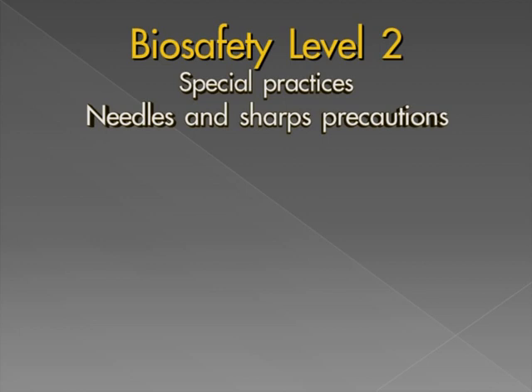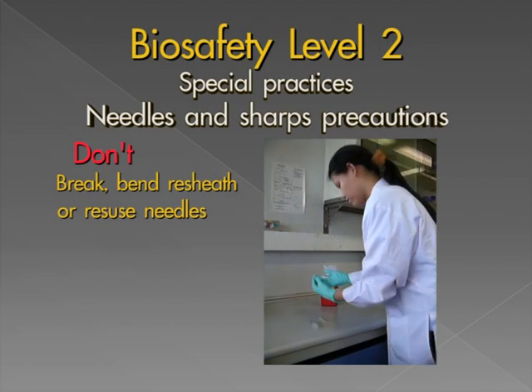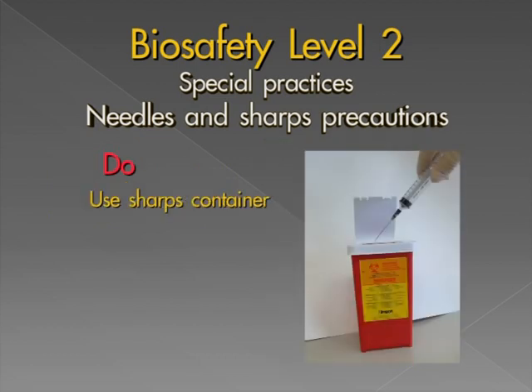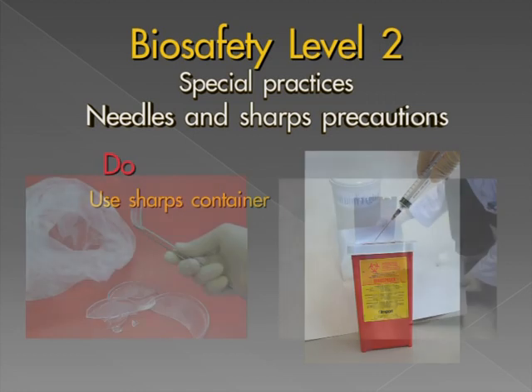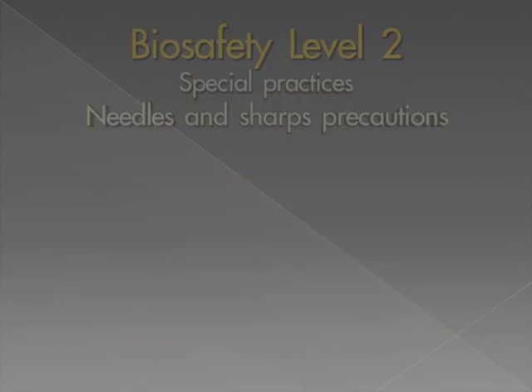Special practices. In most situations, it is best to use single-use needles and syringes. Do not break, bend, or recap needles. Needles and syringes, butterfly needles and their associated tubing, and similar devices should be discarded intact into a puncture and leak-proof container. Other sharps items, such as broken glass, should not be picked up by hand.